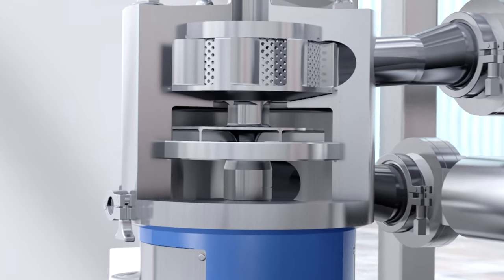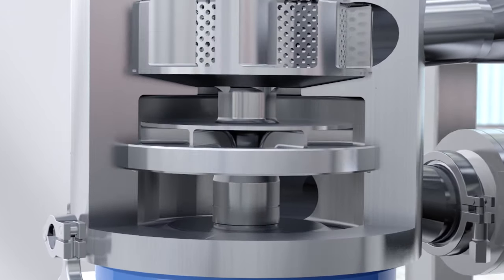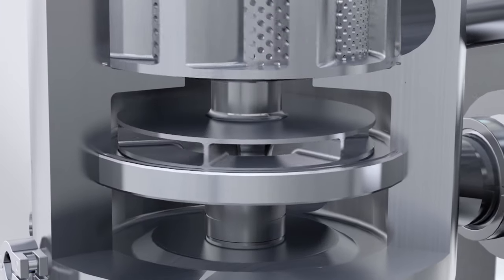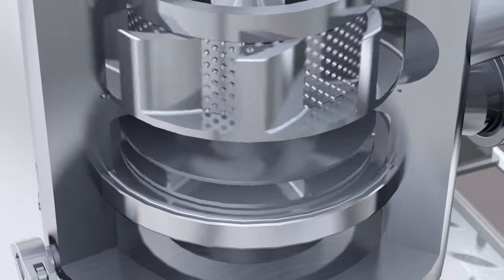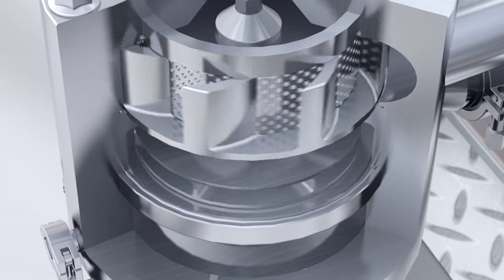The CMX operates in two stages. The additional pumping stage gives it a very stable characteristic curve. The upper second stage mixes the solid and liquid phase without clumping.